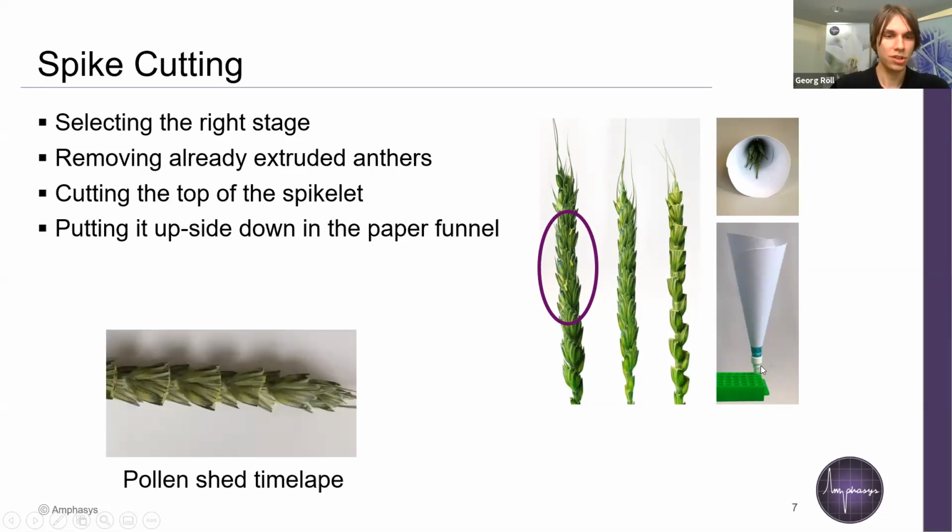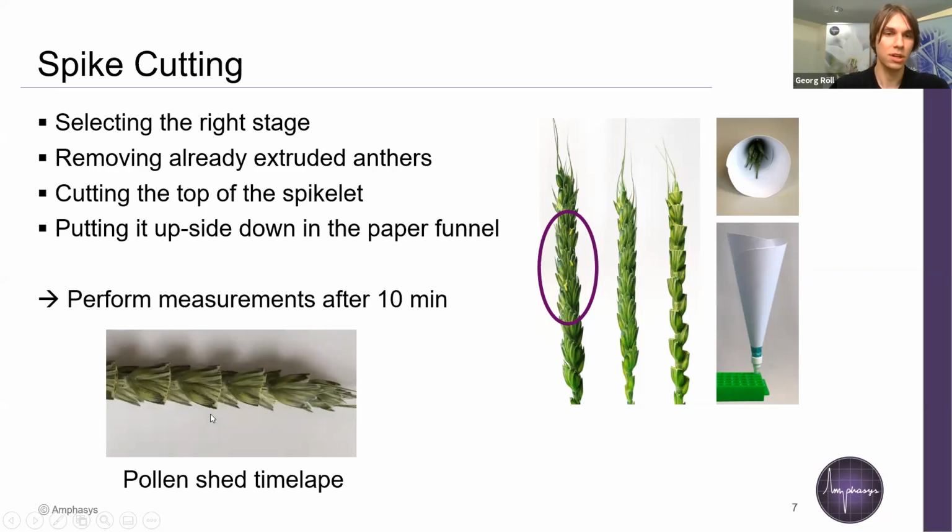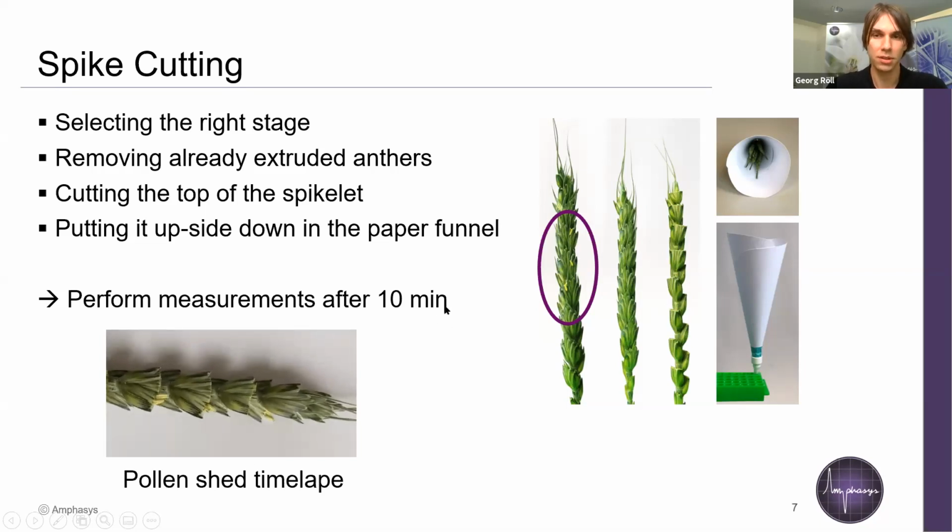And the pollen shed goes quite fast. You can see this in this video here, it's a time lapse, how fast the anthers are extruded by the filament, and then the pollen shed starts. So basically you can perform a measurement after 10 minutes.